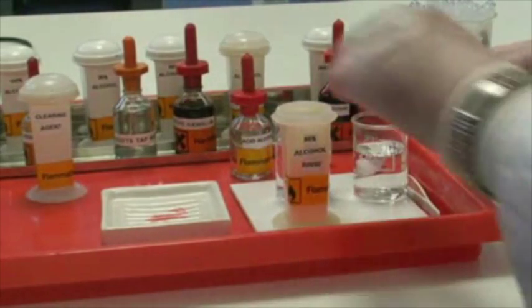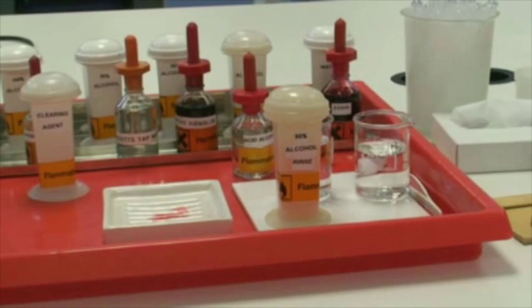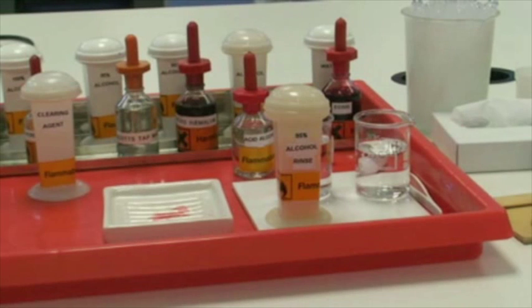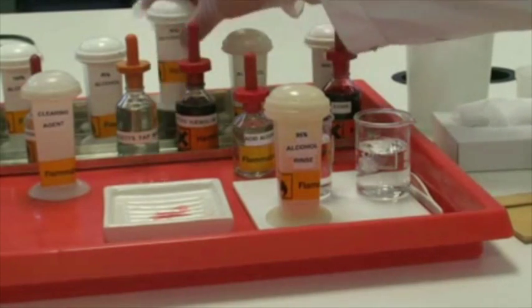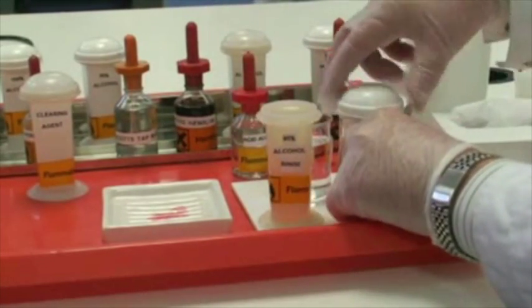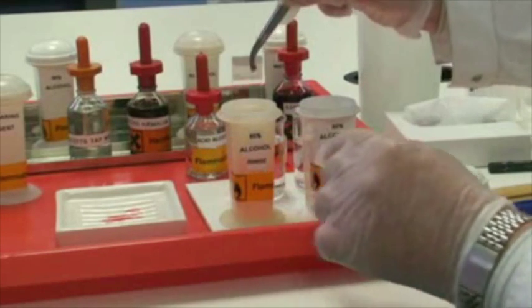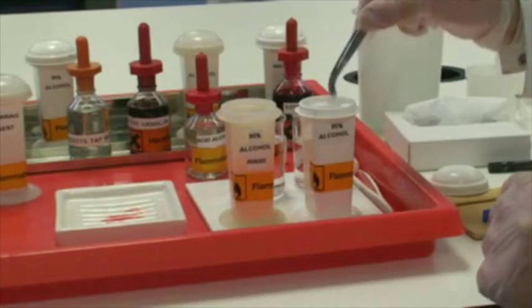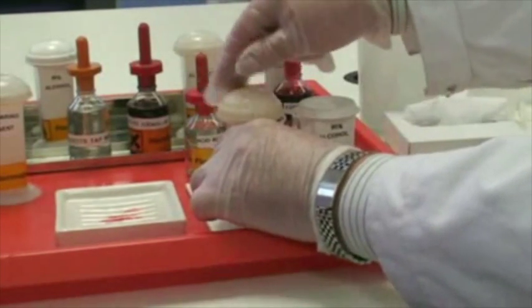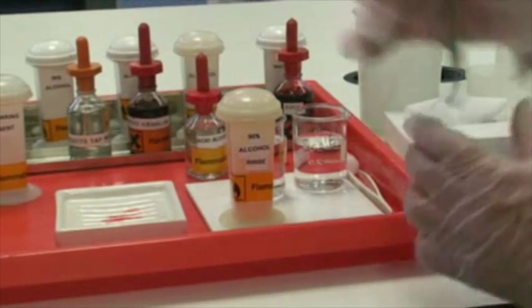Our next step will be to process from 95% alcohol, as we're already there — we won't go back to 70%. Our first step in the dehydration process will be to transfer into our first 95% alcohol. We've taken it from the rinse into the first 95% alcohol. Remember, these are critical times — two minutes each. So we start the clock again.